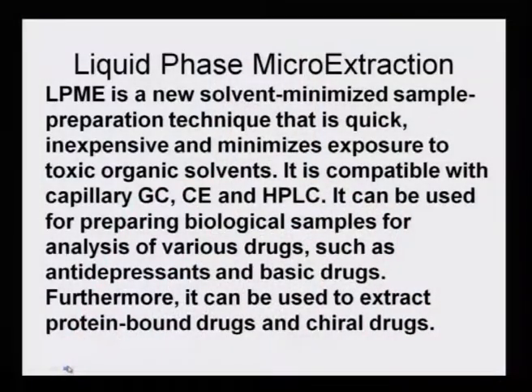LPME, or liquid phase microextraction, is a new solvent-minimized sample preparation technique that is quick, inexpensive, and minimizes exposure to toxic organic solvents. It is compatible with capillary GC, with capillary electrophoresis and HPLC.